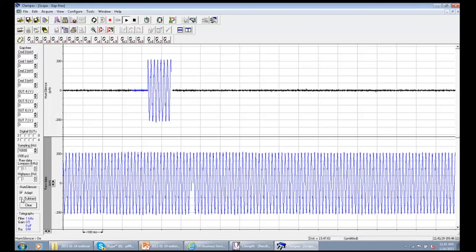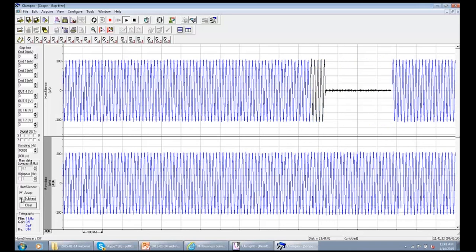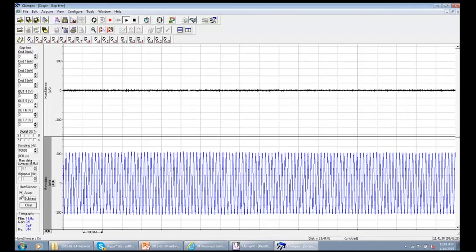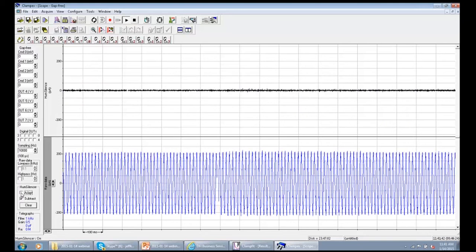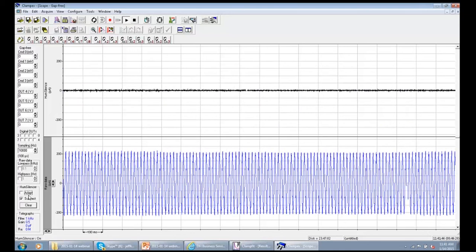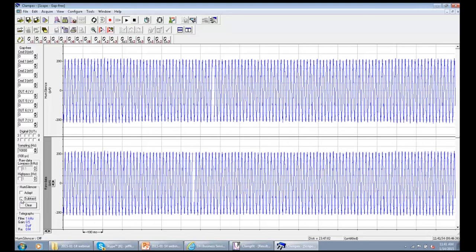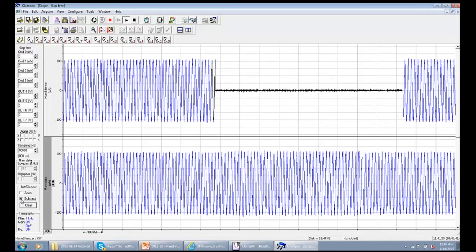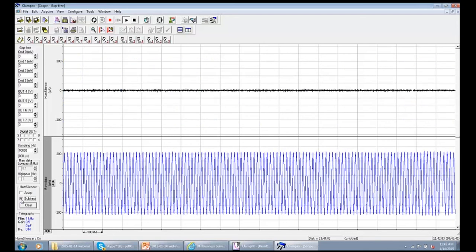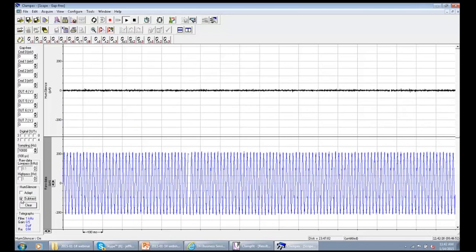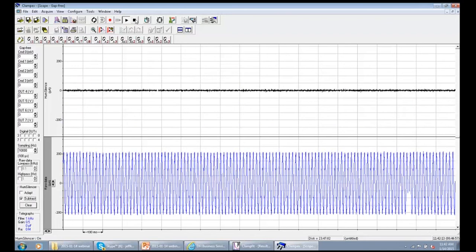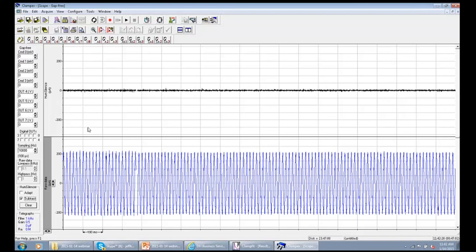If I deselect the Subtract checkbox, the noise comes back. When I check it again, the noise is gone. If I uncheck the Adapt checkbox, the noise is already learned — so even without new learning, the existing learned pattern is used. Deselecting the Subtract brings the noise back, but checking it again eliminates the noise immediately using the already-learned pattern. This demonstrates that the Hum Silencer can eliminate noise very fast when the noise pattern is already learned. I'm using gap-free mode right now, so I can select and deselect during acquisition — this is not possible in episodic stimulation mode.